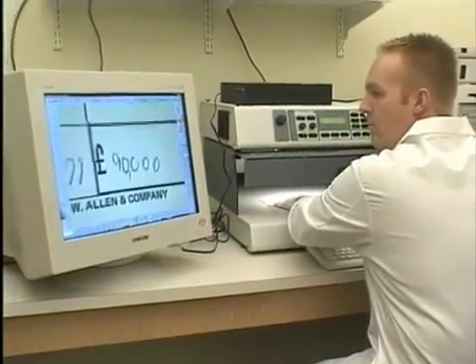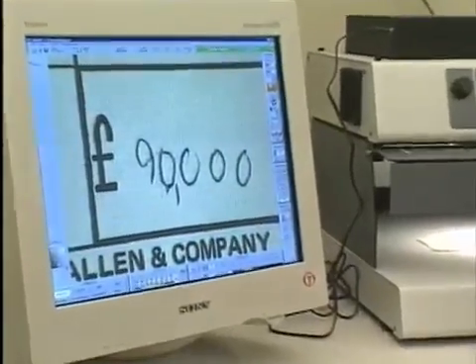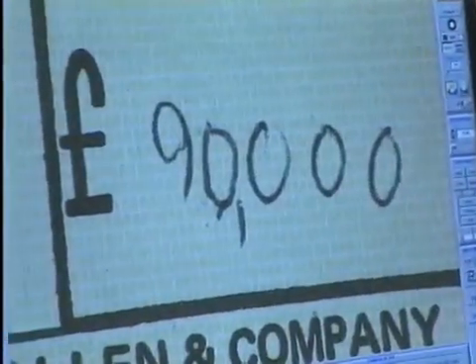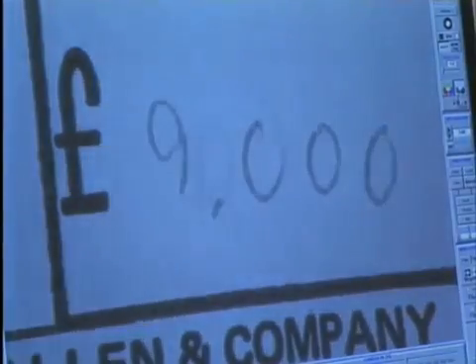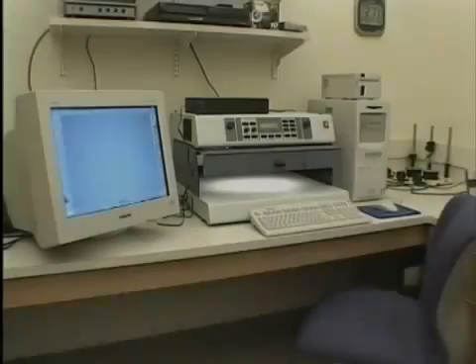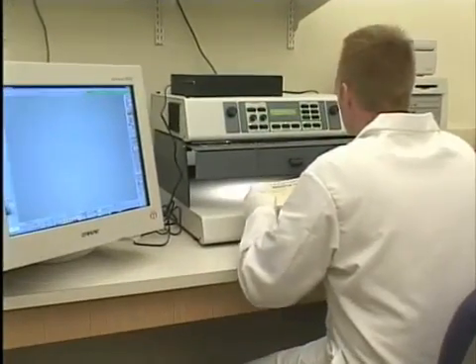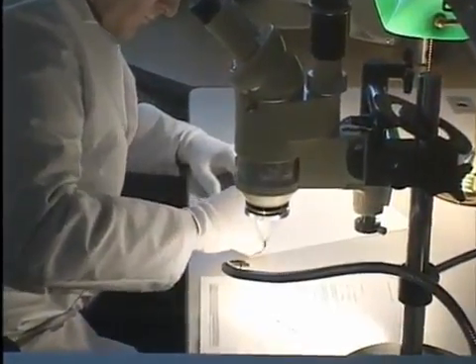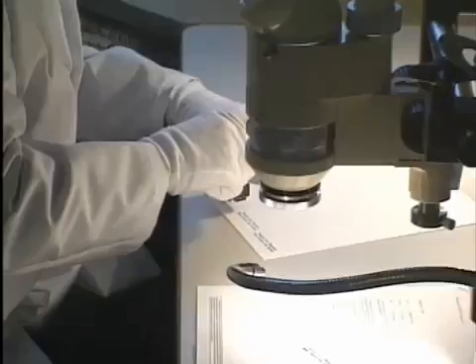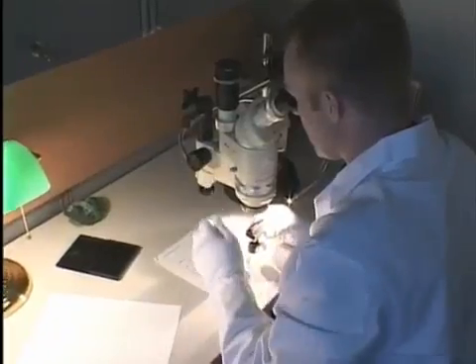Some criminal activity involves an attempt to change a document. In these situations, the examiner may use an instrument called a video spectrocomparator to determine if the document has been modified. The instrument exposes the document to various wavelengths of light which show, in this example, the amount was written by two different inks. Writings destroyed by fading, burning, water damage, or chemical destruction may be revealed in this same manner. In addition to examining the writing style or the paper characteristics of a questioned document, the device that created the question document may also be examined.